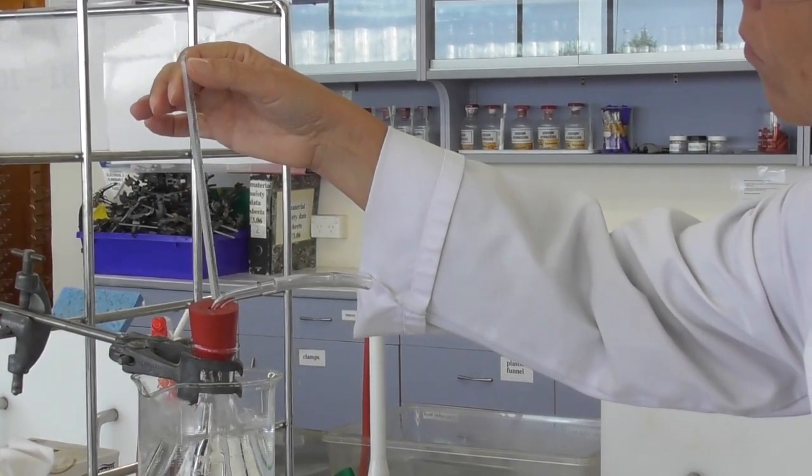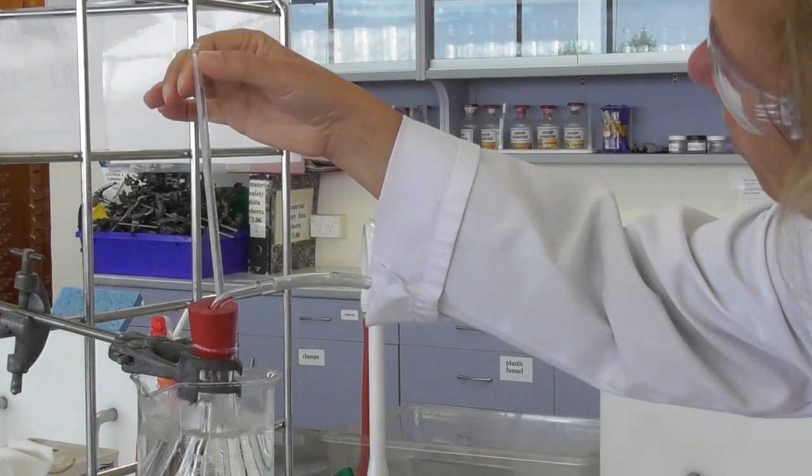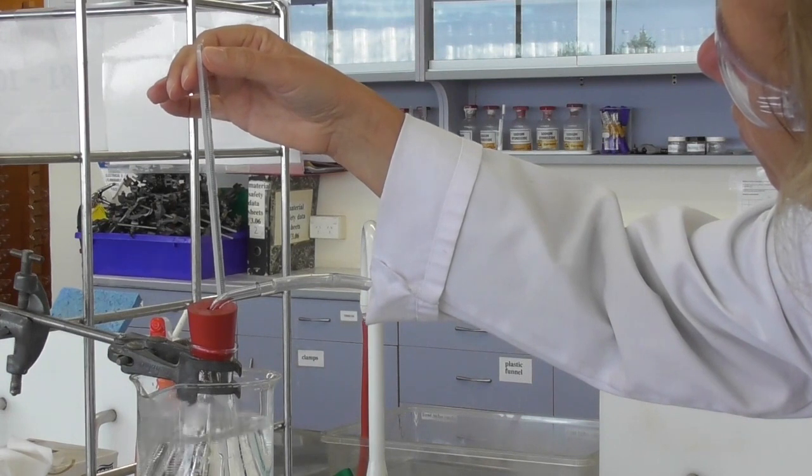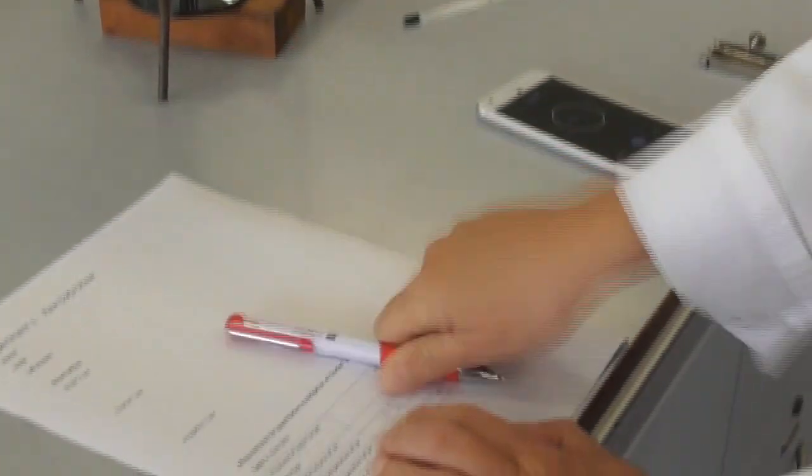While boiling water is usually around 100 degrees Celsius we have to make sure that we take the exact temperature, which is usually a little bit above or below 100 degrees, and we write this temperature down on our sheet.